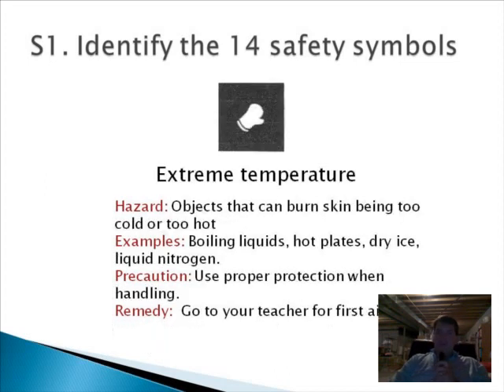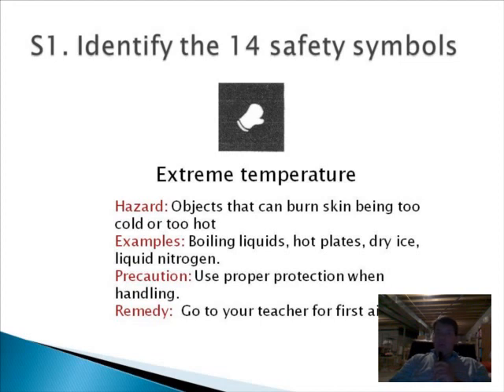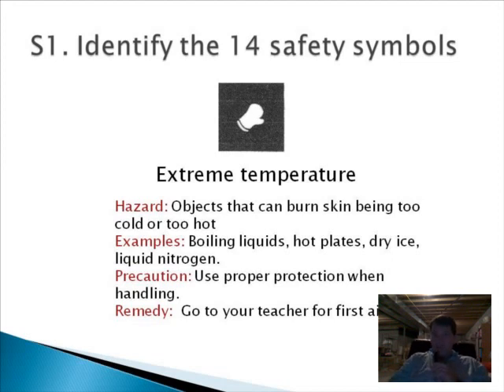The next symbol is the extreme temperature symbol. It's a simple symbol that looks like an oven mitt — so when you see an oven mitt, think extreme temperature. You'll see this when dealing with something really hot or really cold, which poses a danger to your skin. Examples include boiling liquid, hot plates, dry ice, and liquid nitrogen. Use common sense and wear protective gloves. If you get a burn, let the teacher know and we will provide first aid.